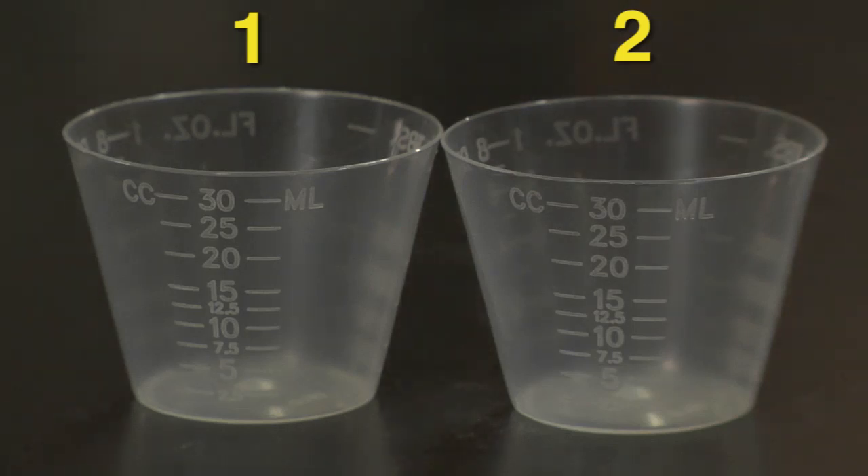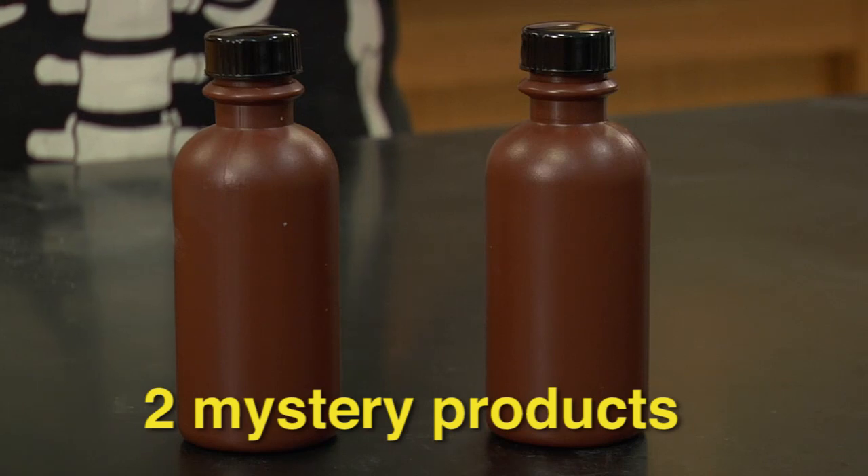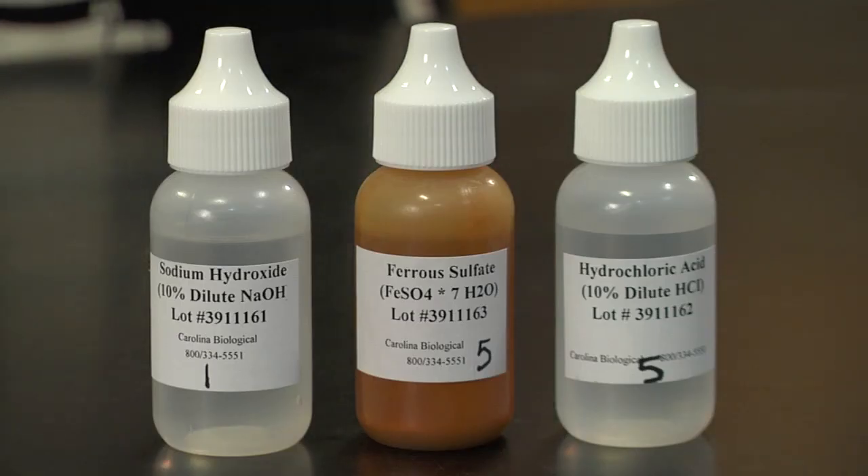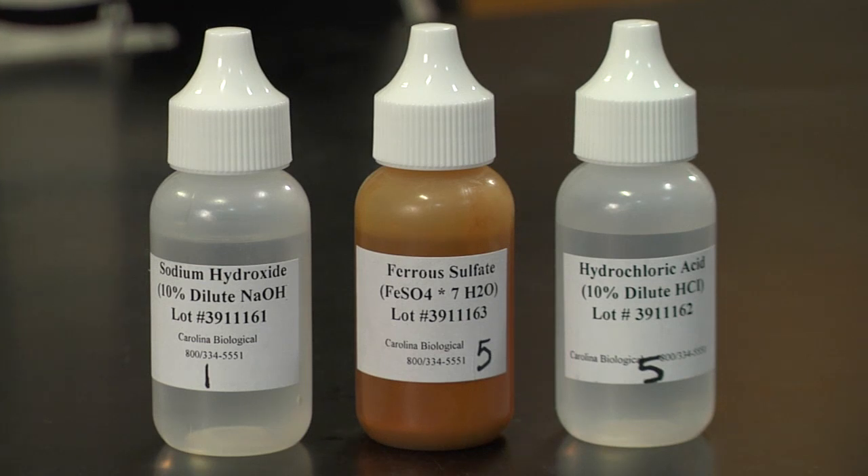First, we'll need two small beakers labeled 1 and 2, the two mystery products, a bottle of 10% sodium hydroxide, a bottle of 10% ferrous sulfate, and a bottle of dilute hydrochloric acid.